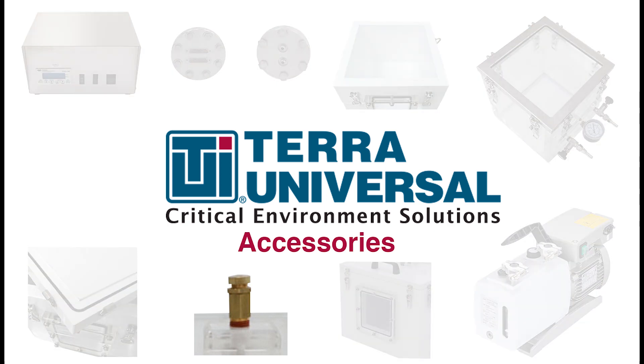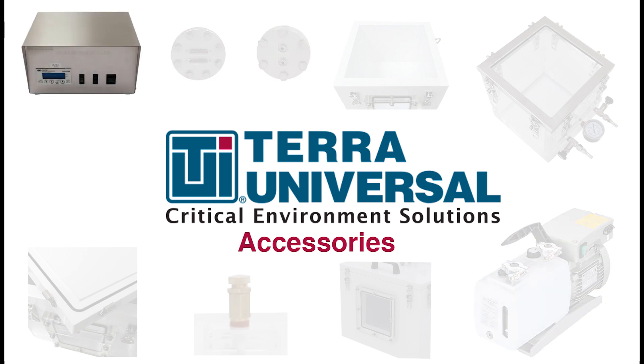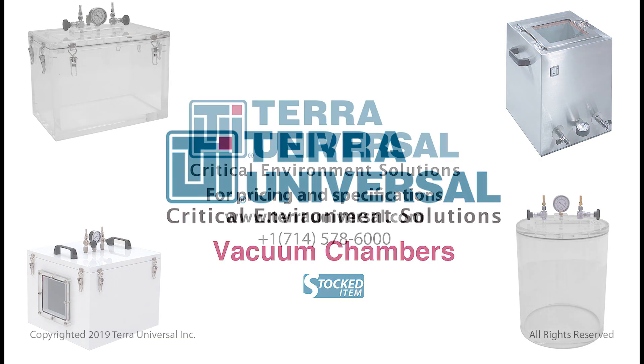Optional accessories include pressure relief valves, coaxial and multi-pin feed-through, vacuum pumps, and a vacuum control module. Our standard models are in stock and ready to ship. Custom designs and features are no problem. Upgrade metal chambers with a tempered glass window, or ask for feed-through installation for power and data cables upon ordering to have a vacuum chamber tailored to suit your specific application.